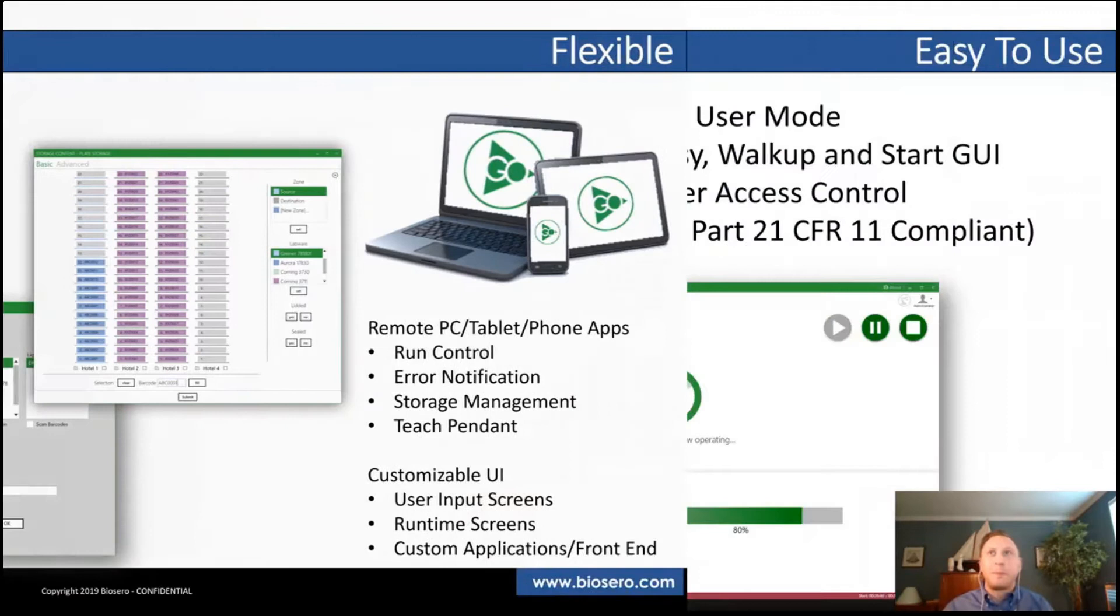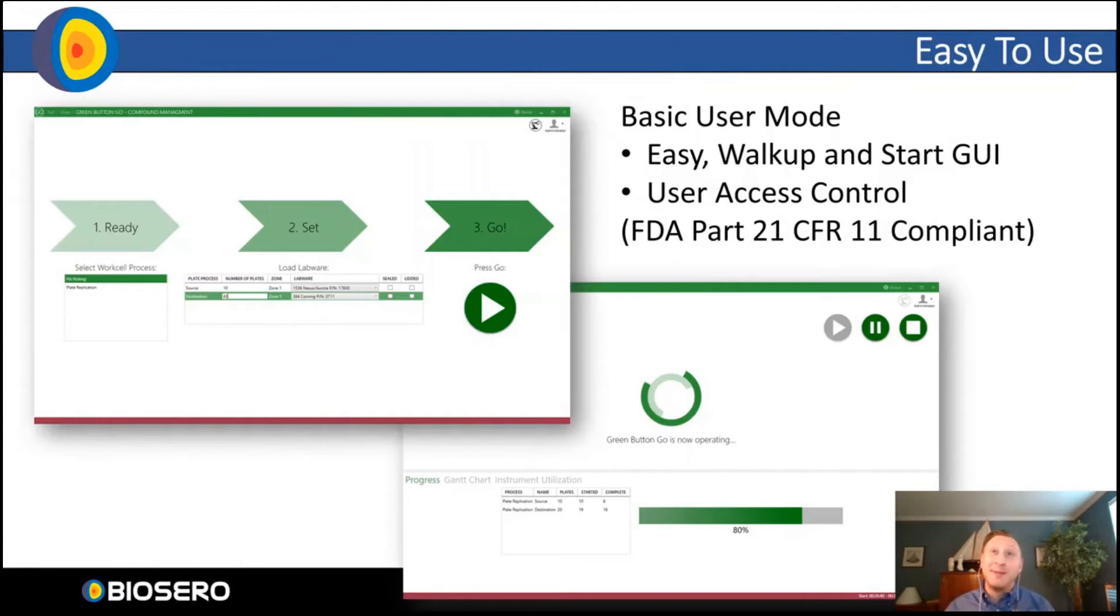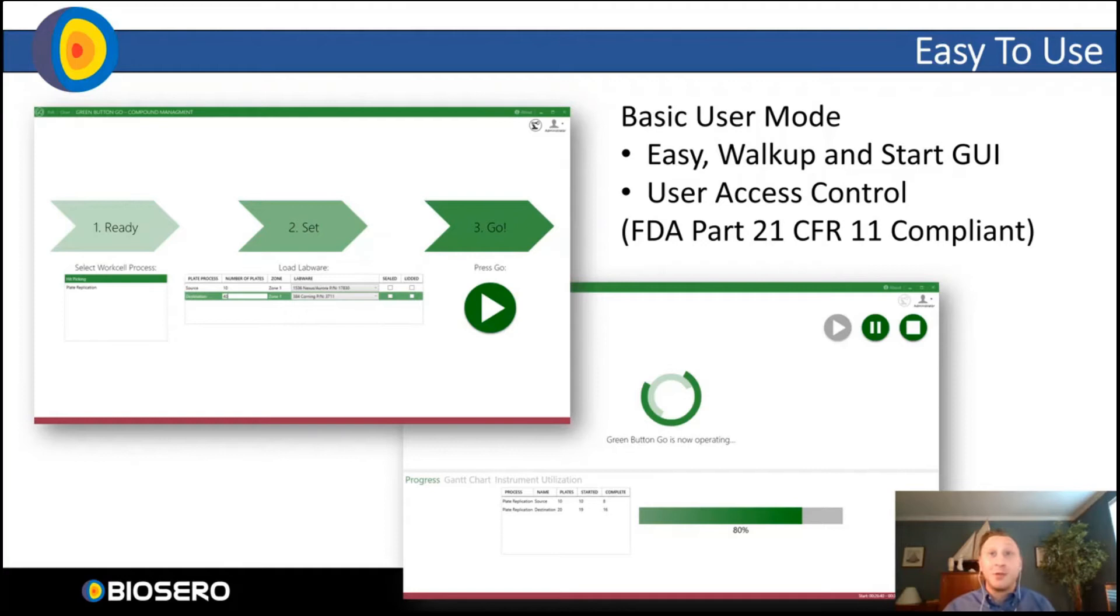From a flexibility point of view, Green Button Go has a number of different tablet or phone applications, and also customizable user interfaces, so you can tailor that automation experience to your users. And lastly, Green Button Go is extremely easy to use. What you see here is an example of the Ready Set Go basic user screen, where when a protocol is deployed to users, all they have to do is walk up, tell the system how many samples they're running, and hit Go. It really is that easy.